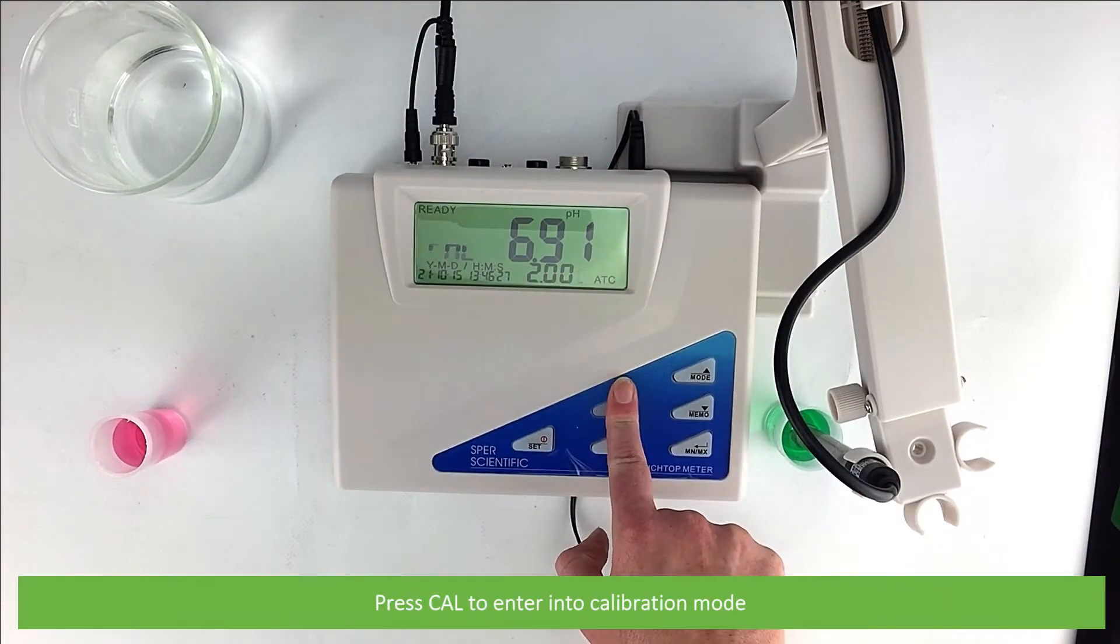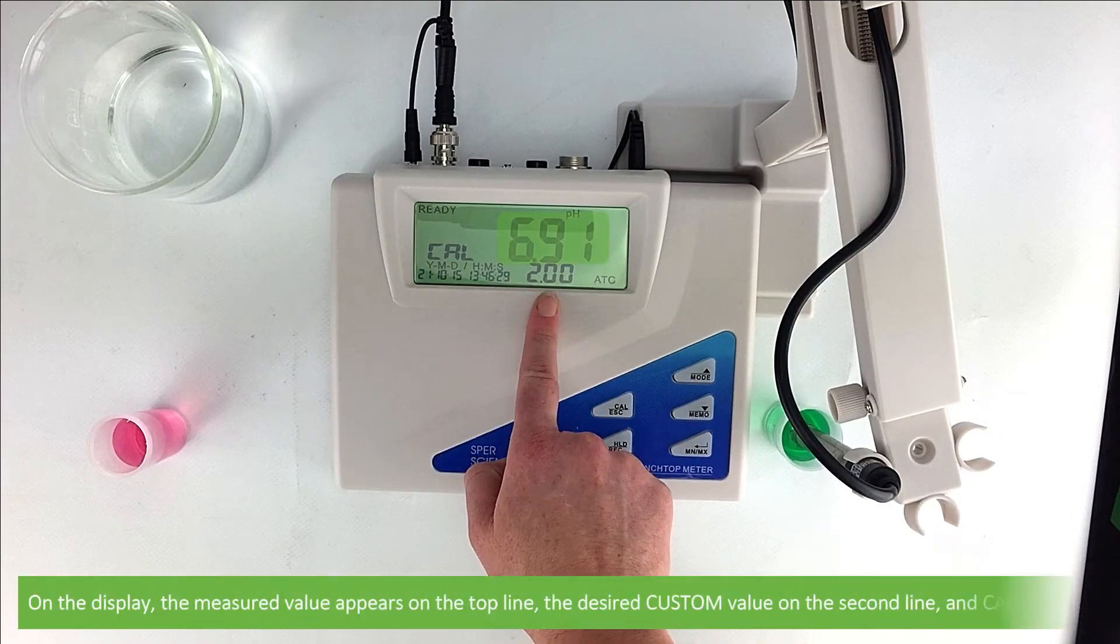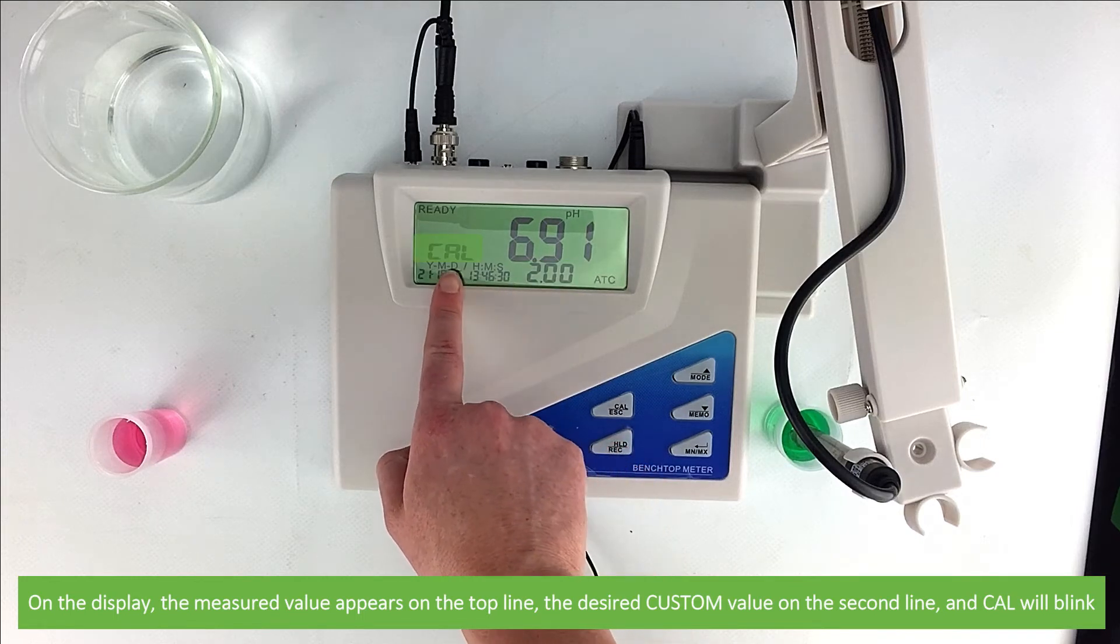Press CAL to enter into calibration mode. On the display, the measured value appears on the top line, the desired custom value on the second line, and CAL will blink.